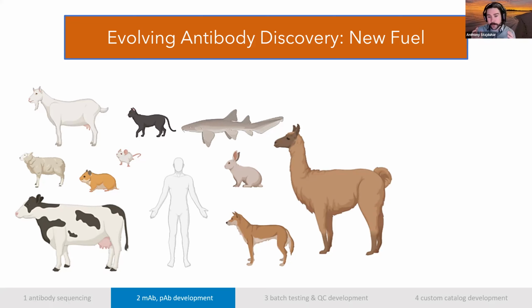We can really explore a great variety of different antibodies that exist in a great variety of the animals that are used for traditional antibody development, not only in livestock, but also in some unique applications like companion animals, as well as obviously one of the bigger cases, which is the human case, which we'll be able to talk about a bit more, not during this webinar, but in the coming months, I believe.